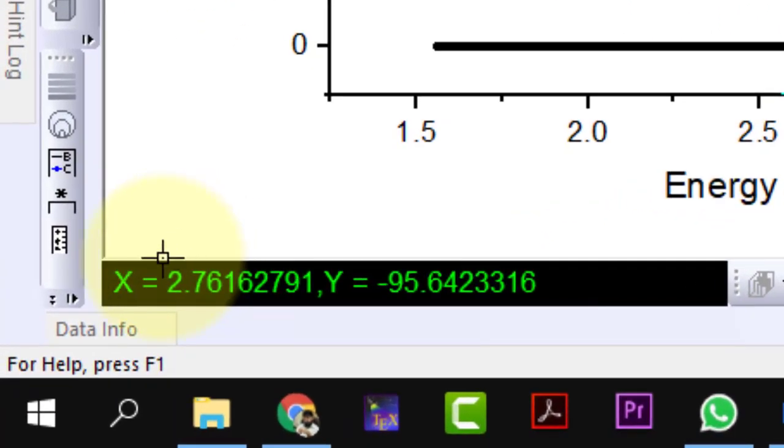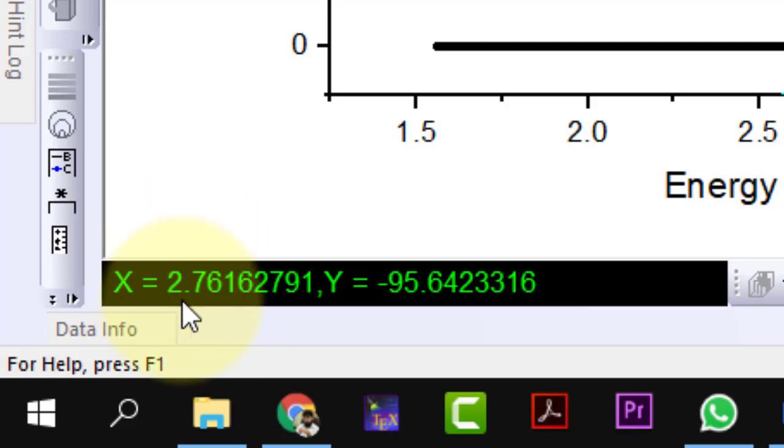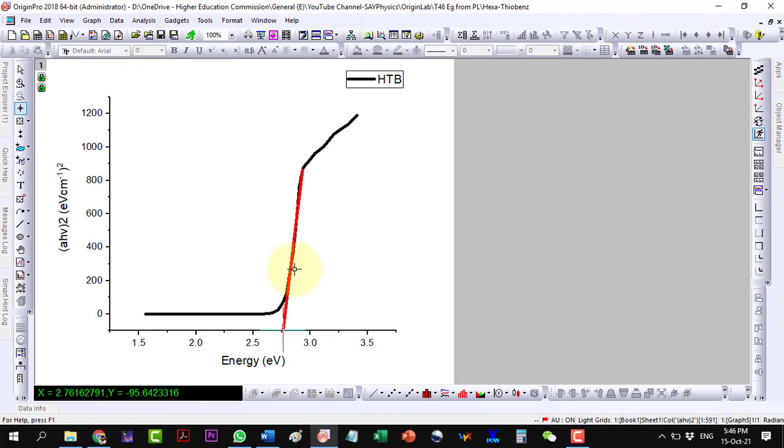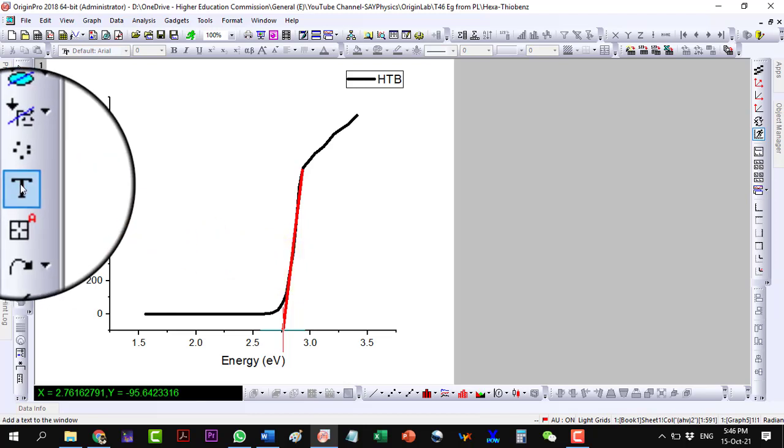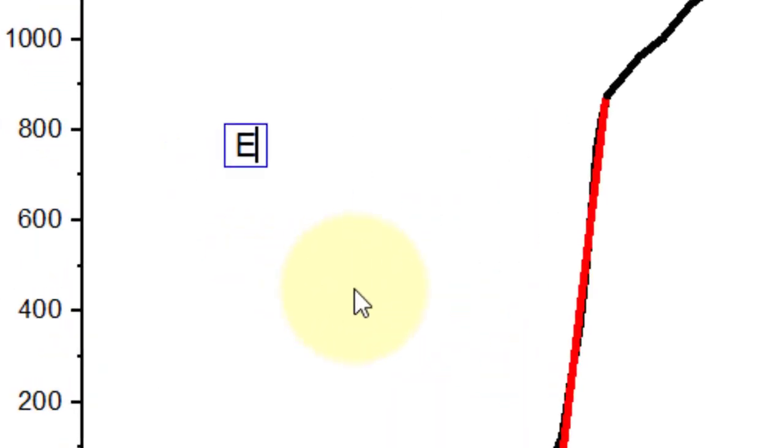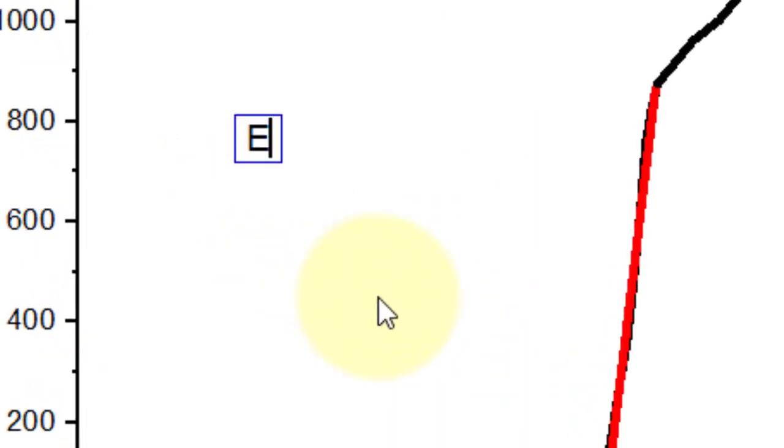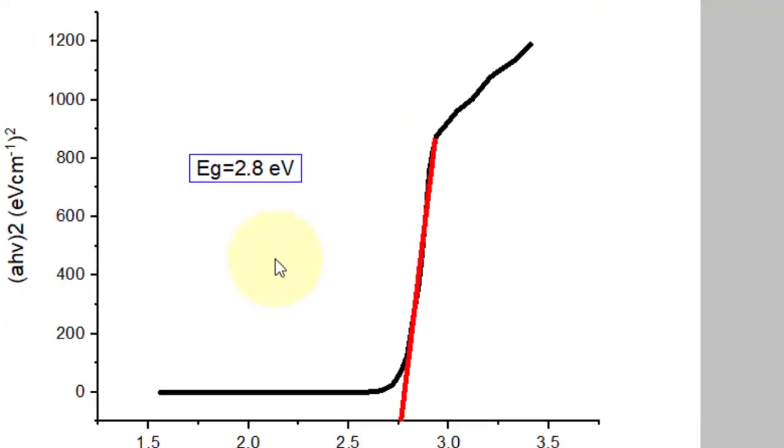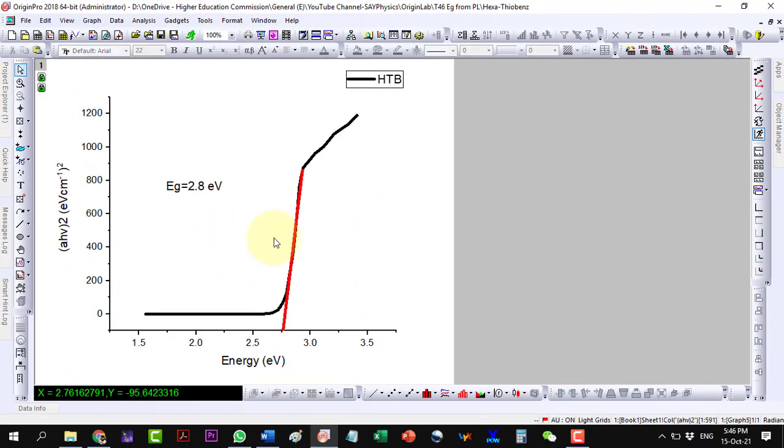The value of the bandgap comes out to be 2.8 electron volts.